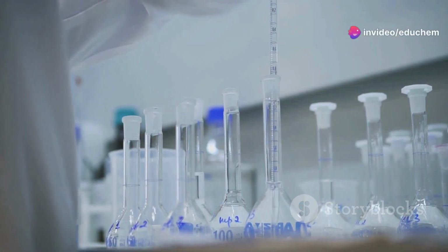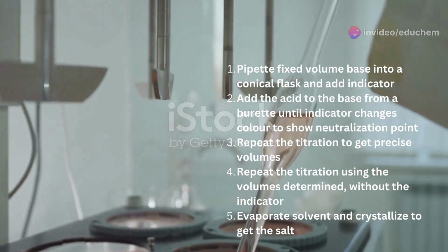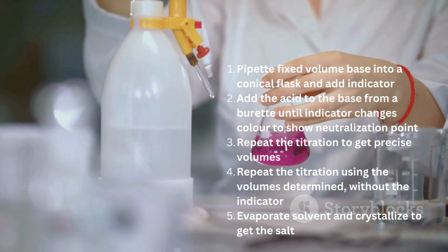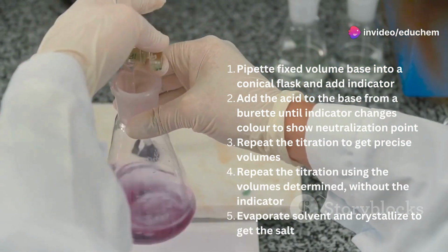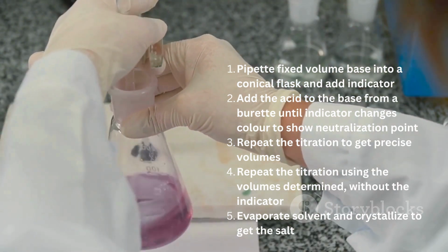Here are the steps in this method. Measure a specific volume of the base solution using a pipette and place it in a conical flask. Add a few drops of an indicator, like phenolphthalein, to the base solution. Slowly add the acid from a burette while constantly swirling the flask until the indicator shows that neutralization has occurred by a permanent color change.